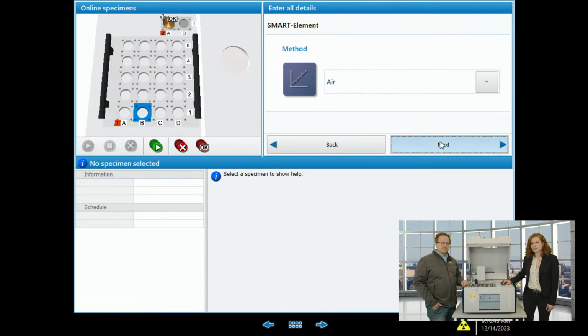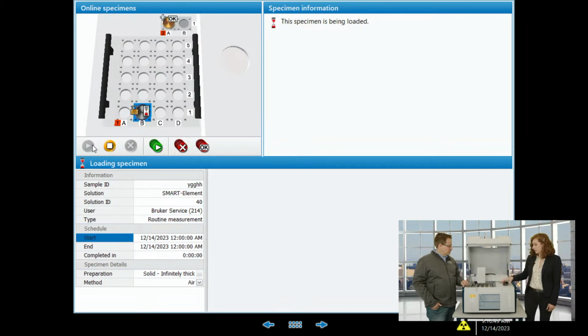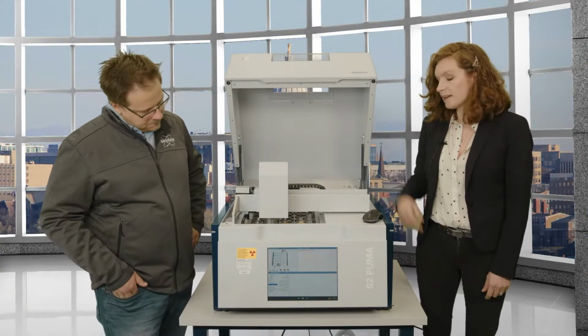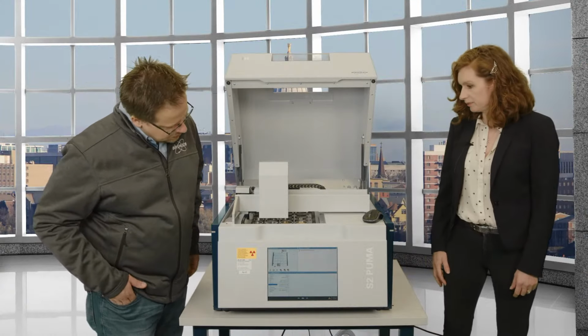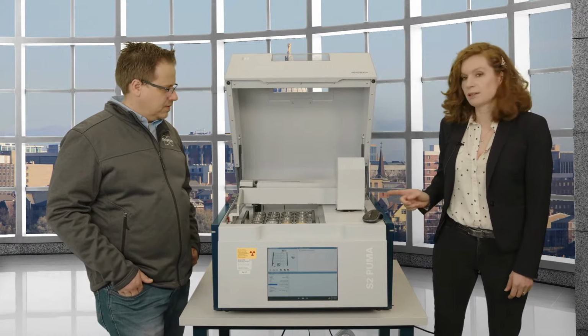So I'm just going to click next here, and we actually played around with the machine a little bit so that we can keep it open while it's going to pick up the sample, right? So you can see the sample handler comes over, picks it up, magnetic, and then it brings it into the machine over there. Opens the lid, and it brings it in.